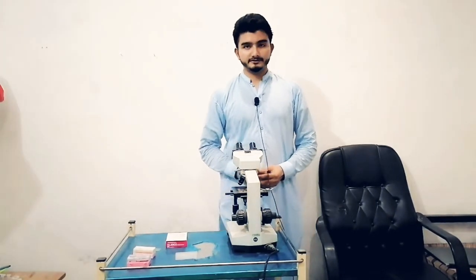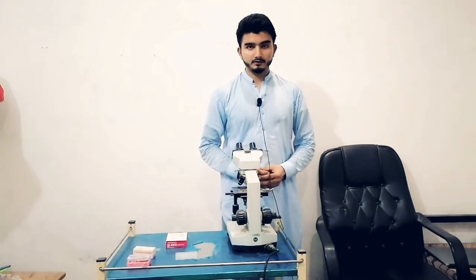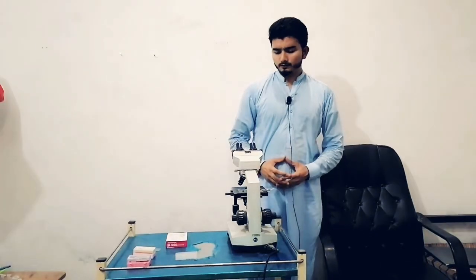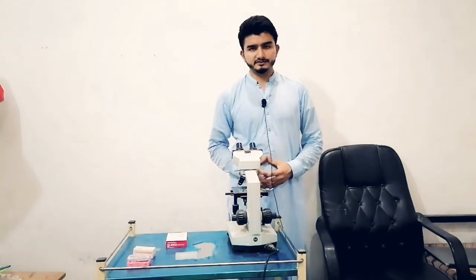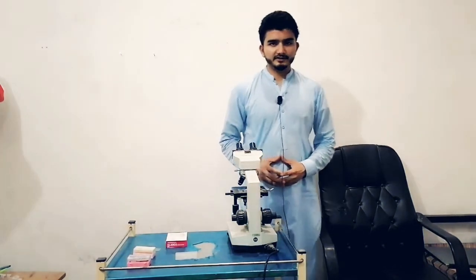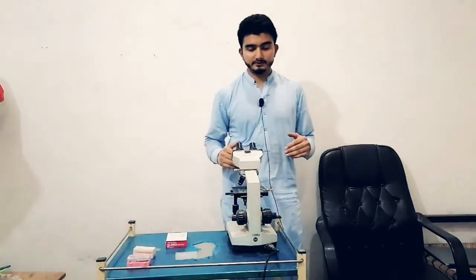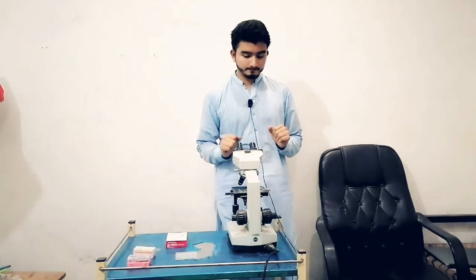Today we are going to discuss a very important topic, and that is an instrument called the microscope. So how was the microscope discovered, and when was it discovered? Initially the microscope was designed by Zacharias Janssen, and further it was modified with time and now we have the original form of the microscope. There are two types of microscope: compound microscope and electron microscope.